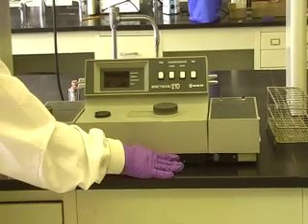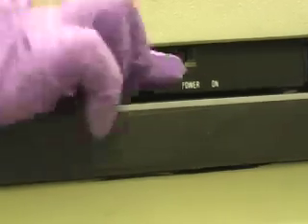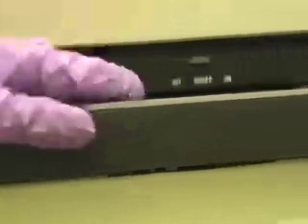Turn on the spectrophotometer using the power switch along the bottom of the machine. For best performance, let the machine warm up for 15 to 30 minutes.